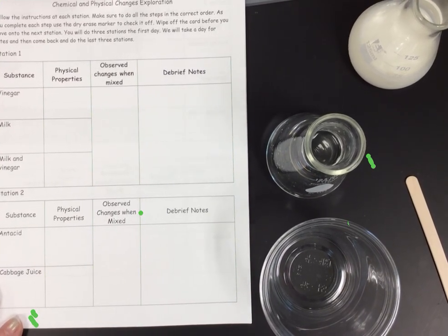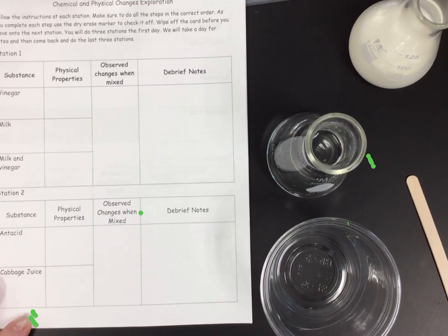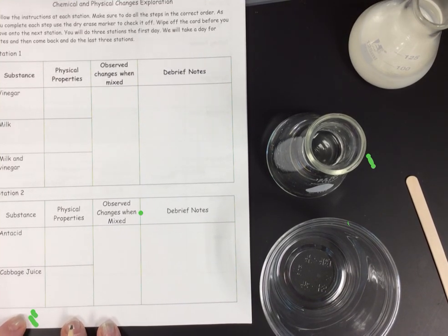We are going to video the chemical and physical changes exploration lab for you, and we are doing this in two parts. Today we will do stations 1, 2, and 3 and show you the steps that we're going to follow in the classroom, and you can follow the same things on KVA.